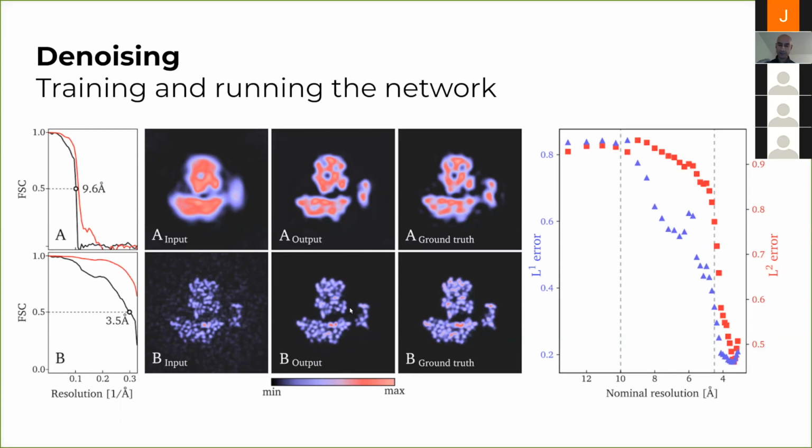So I hope this kind of gives the idea of what we're doing here. We're not explicitly saying that the algorithm should do solvent flattening or that it should remove these artifacts. We're actually letting the data guide us. The data shows us that if the ground truth looks like this and the noisy image looks like this, then something like this is a much better next guess than this, which contains all of these artifacts or this background noise. So that's the new part of this idea: we're not hard coding, manually building these things into the reconstruction algorithms, but we're letting the data guide us.